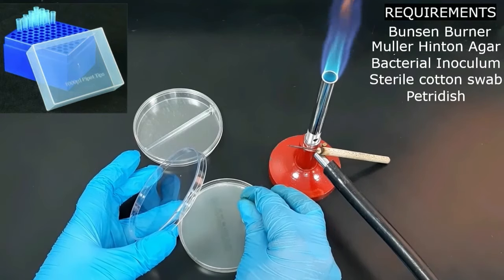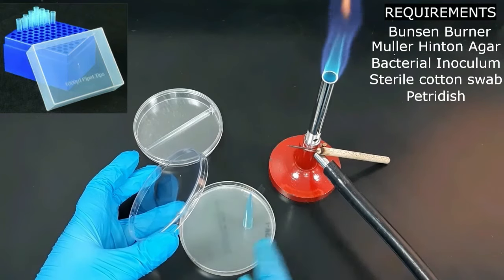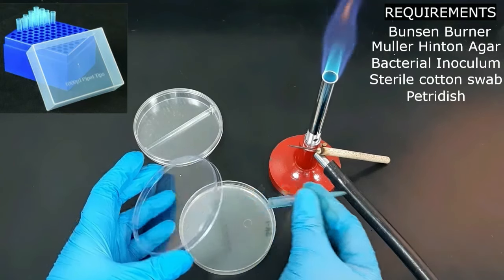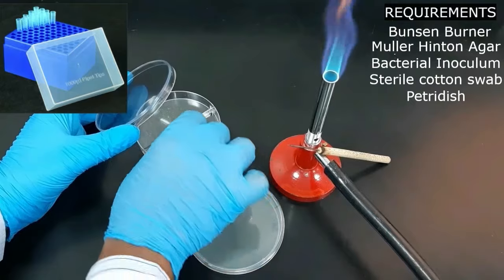Then puncture the well with the backside of a blue micropipette tip with little pressure. Slightly rotate left and right, then remove and discard the tip.